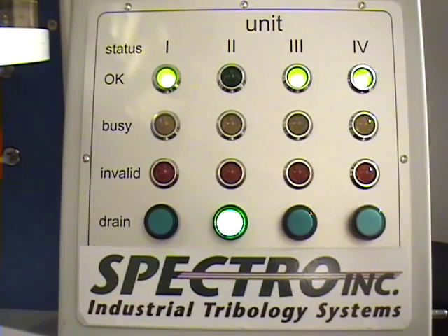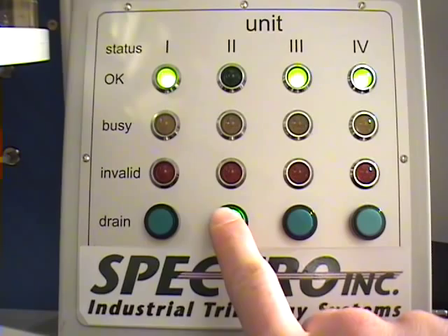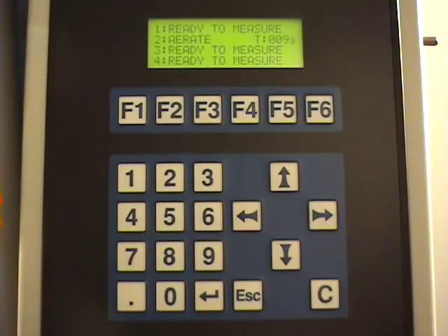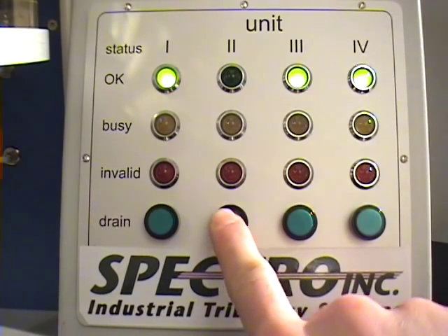To interrupt a cleaning cycle already in progress, press the drain button. Pressing it again will resume the cleaning cycle.